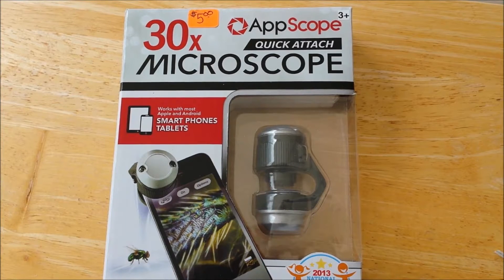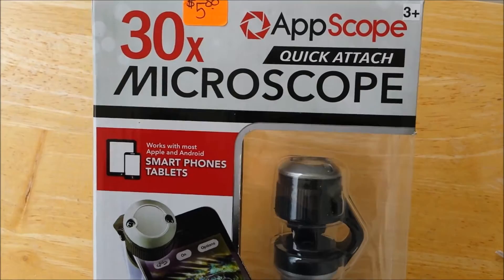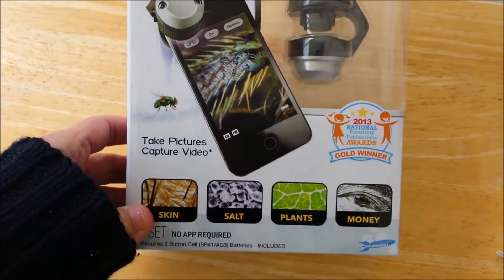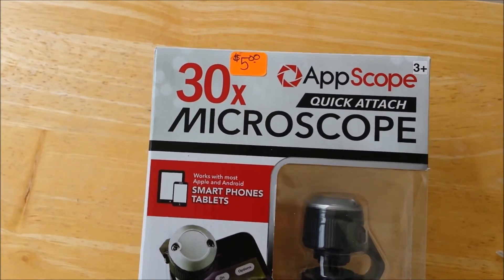I'll give you a quick video review on how to use the AppScope 30x microscope, which quickly attaches to your cell phone or tablet. This sells on Amazon for $18 and something. I got it at the local thrift store for $5, and I love gadgets so we have to check it out.